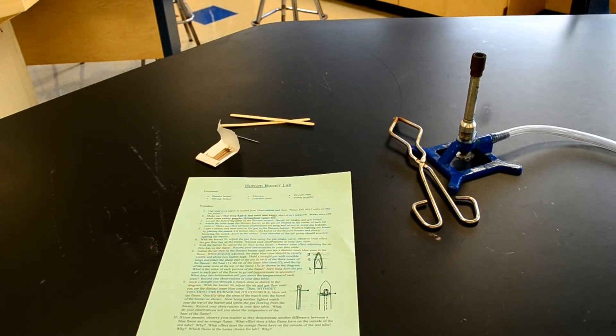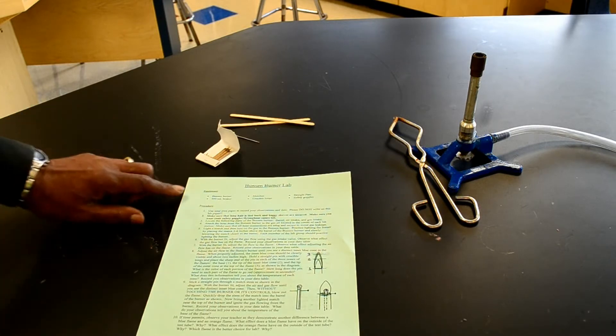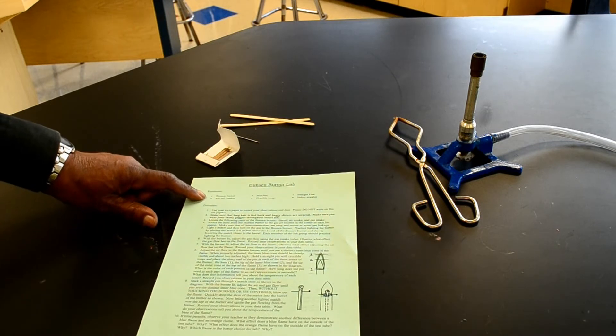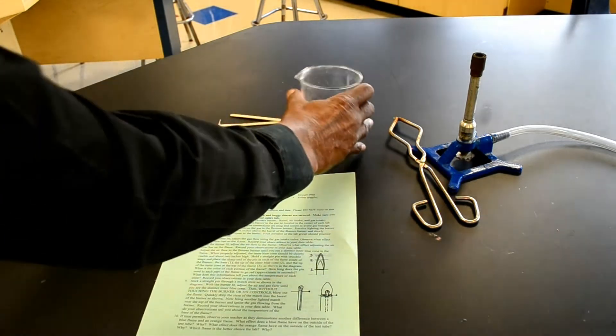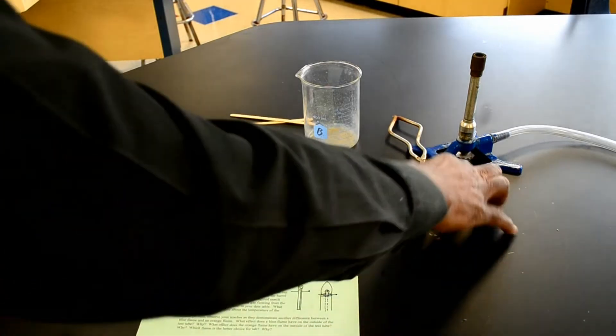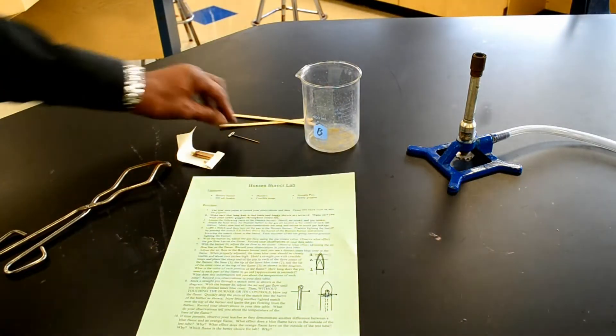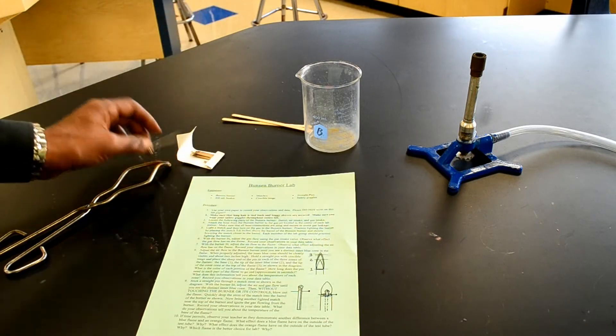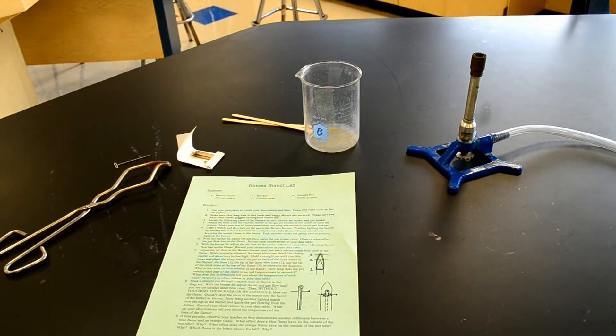It's called the Bunsen burner lab. The equipment needed is a Bunsen burner, a 400 milliliter beaker, matches, crucible tongs, a straight pin, and of course, safety goggles.